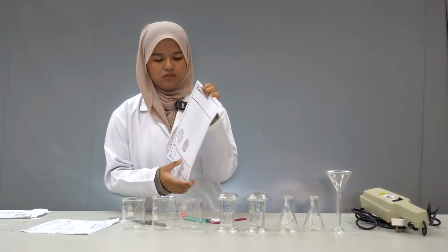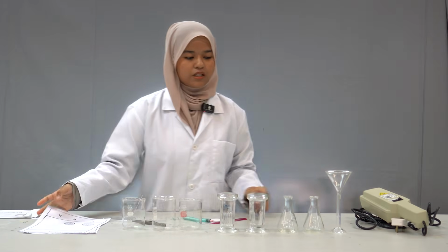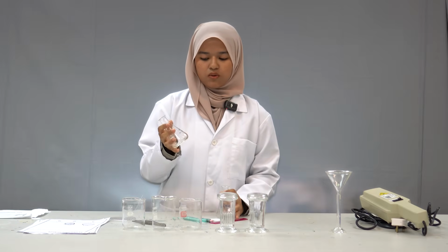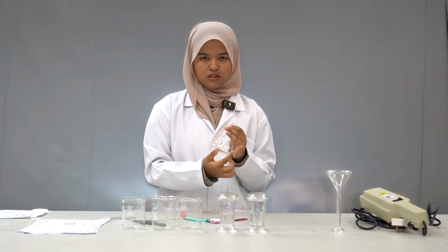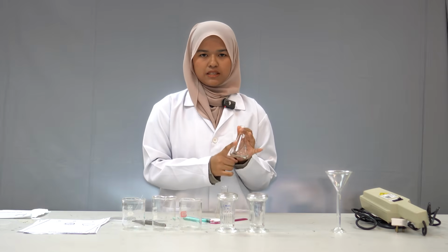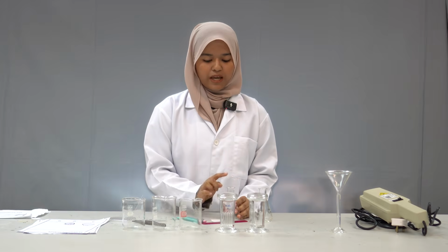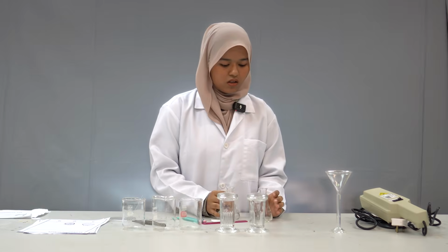Then we will prepare our developing solvent. Don't forget to label your flask. This one is for the DCM and hexane. We will put DCM and hexane in a ratio of 9:1, and hexane and ethanol also in a ratio of 9:1.